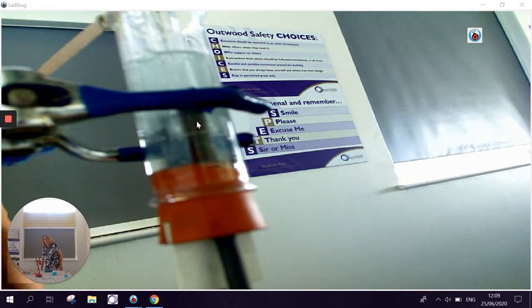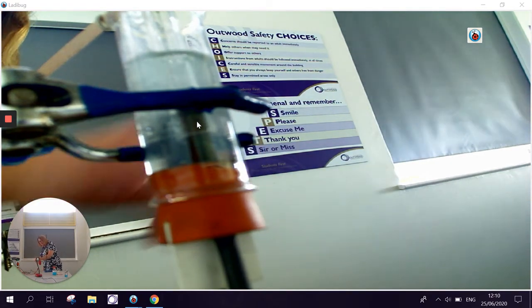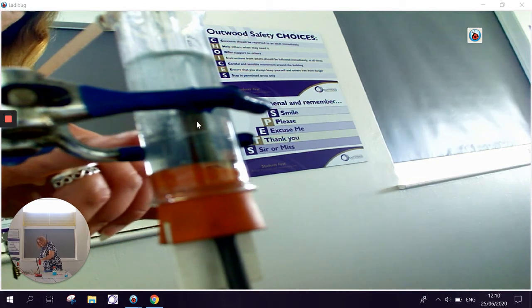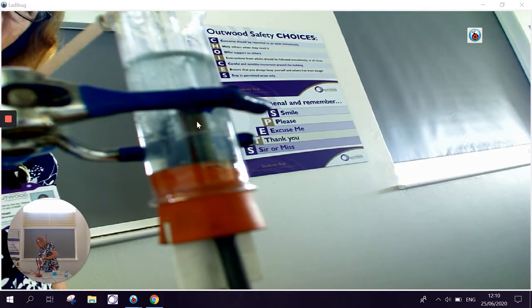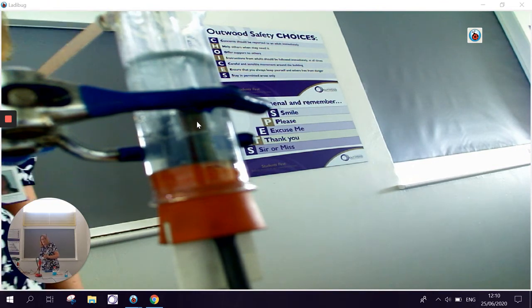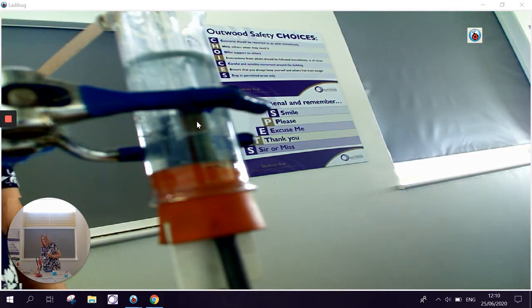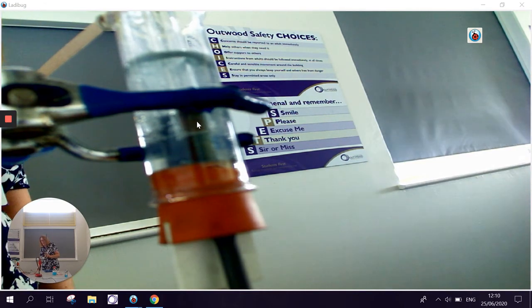Sometimes in exam papers you might see a different setup — it looks like it's been inverted. In this case we've still got our solution of sodium chloride in the tube and electrodes attached to a power pack, and you should be able to see gas bubbles forming at each electrode. Sodium chloride solution is a little bit more complicated than copper chloride. Not only have we got the ions from the salt — the sodium and chloride ions — but when we put an electric current through water, water also ionizes, giving us hydrogen ions and hydroxide ions.